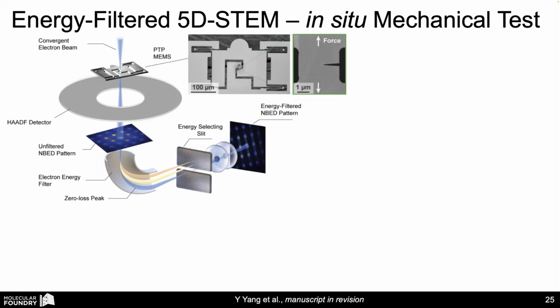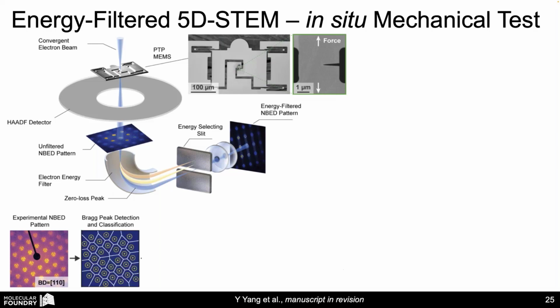And so if we know where the material is going to fail locally or where defects are going to be introduced, such as at the edge of a crack tip, which we're simulating here, this means we can zoom in and do all our measurements right at that location. So if you compare the nanobeam electron diffraction pattern here to different properties that we want to extract here, virtual detectors for them, this is the first step.